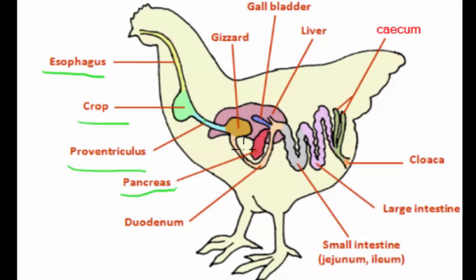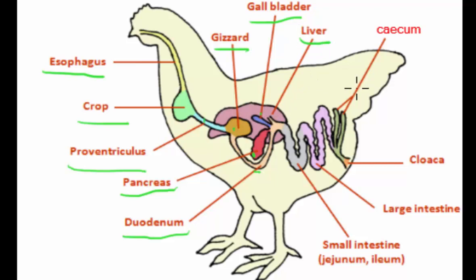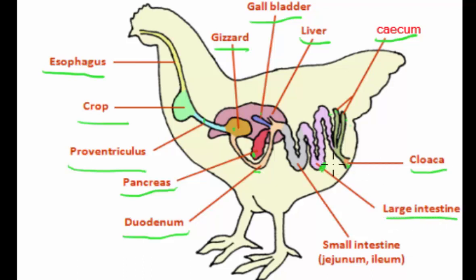This is the location of the pancreas, and this is the duodenum. We have the gizzard — this is the part of the gizzard. There's the gallbladder — this part is the gallbladder. The liver is close to the gallbladder. This is the location of the cecum. This is the cloaca, and this is the large intestine.